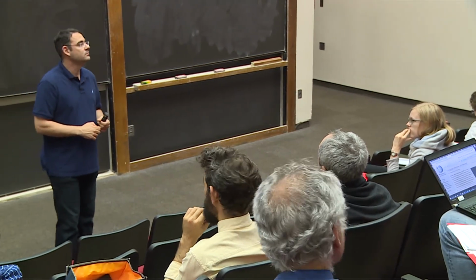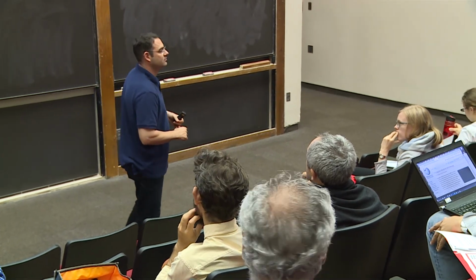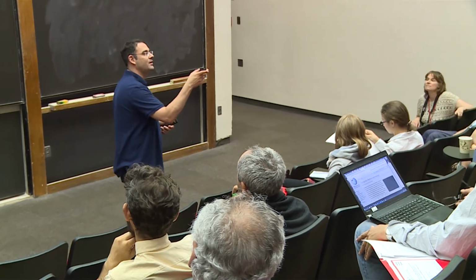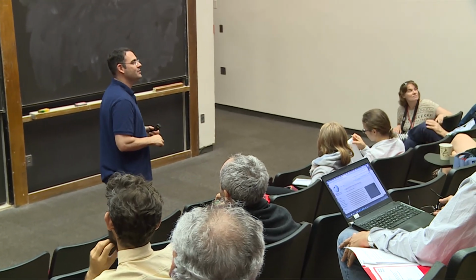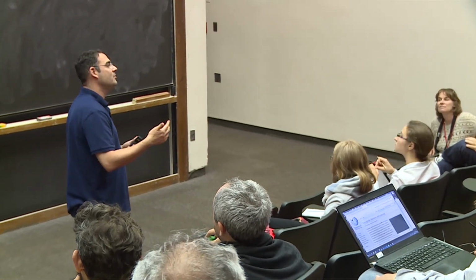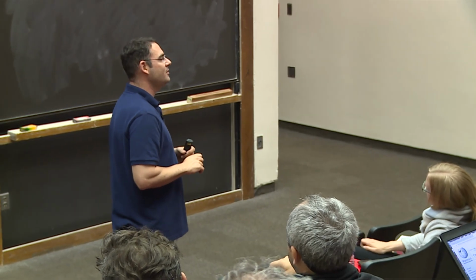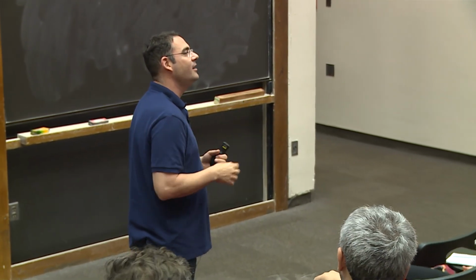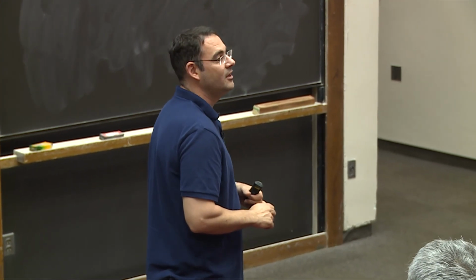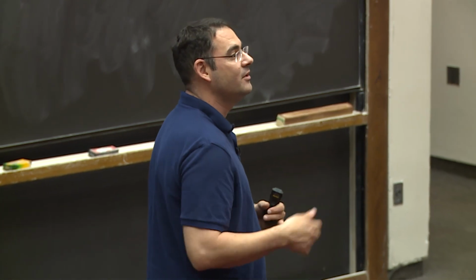Another question? Yes. What's the typical size of the system for that equation? How are you solving it? So it depends exactly on the previous question: what's the resolution that you're aiming for? If you aim for very low resolution, you just want to get some rough idea of how the molecule looks, what some people call an initial model that you can use for further refinement, then maybe there are not going to be many variables, say a few hundred.